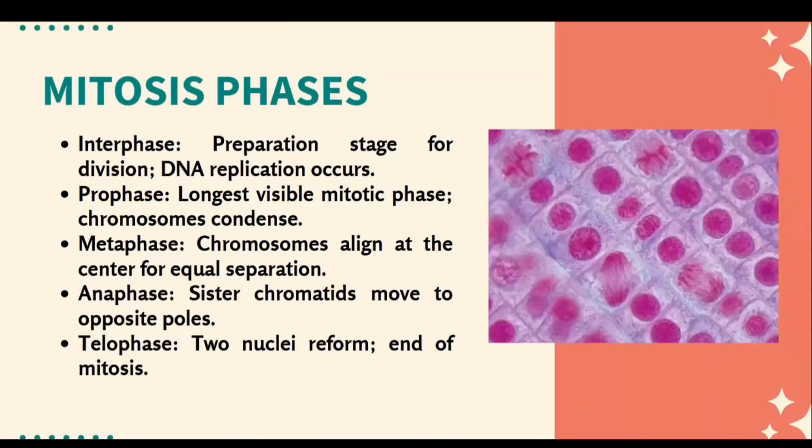There's the mitotic phase. The mitotic phase consists of 5 main stages. The first phase is interphase, when the cell prepares for division by replicating DNA.